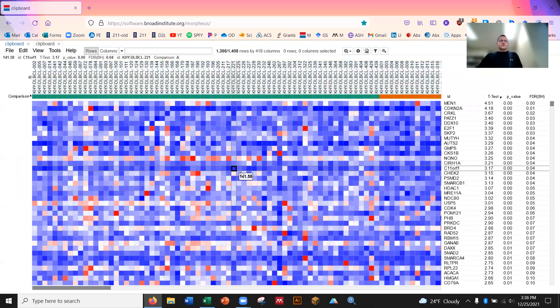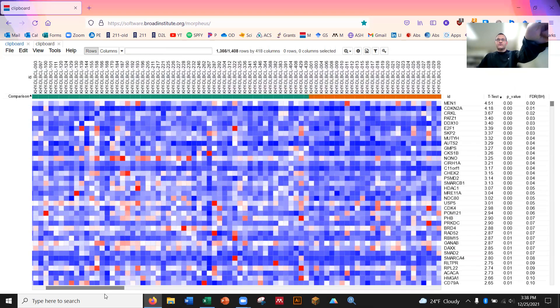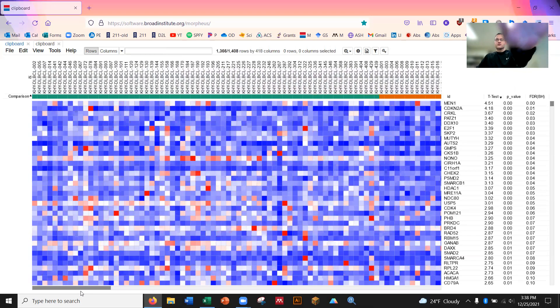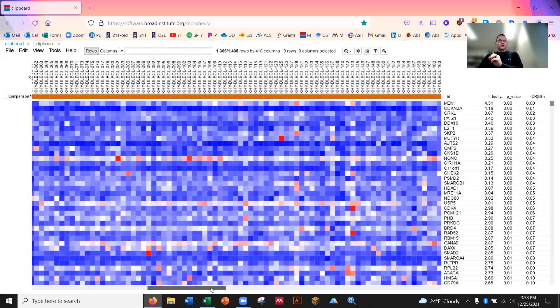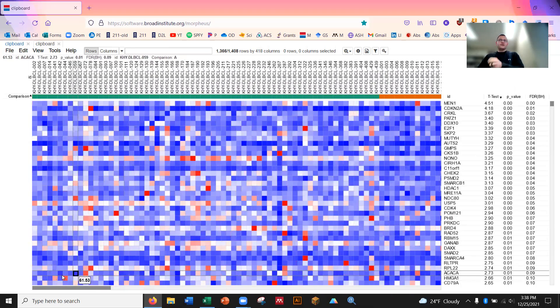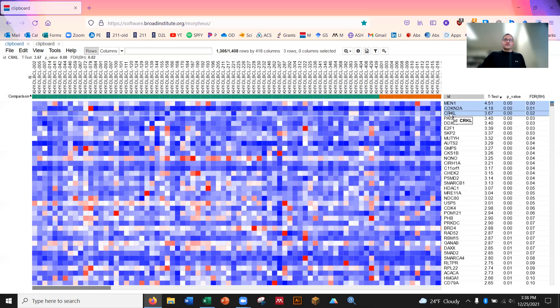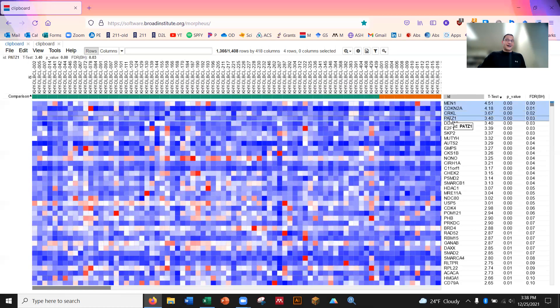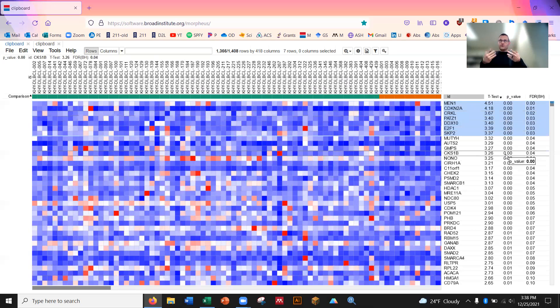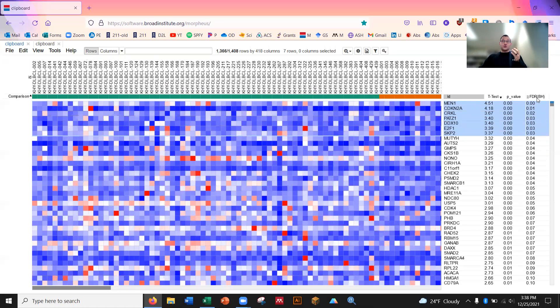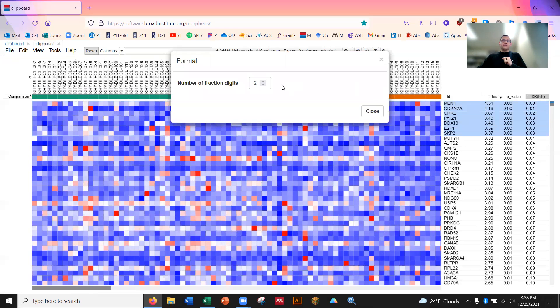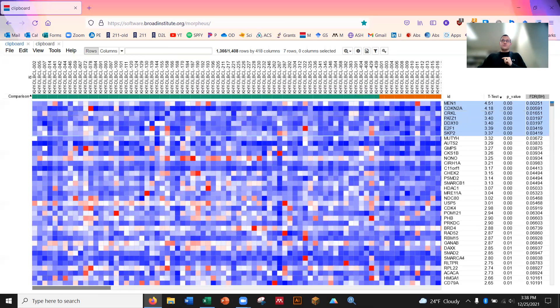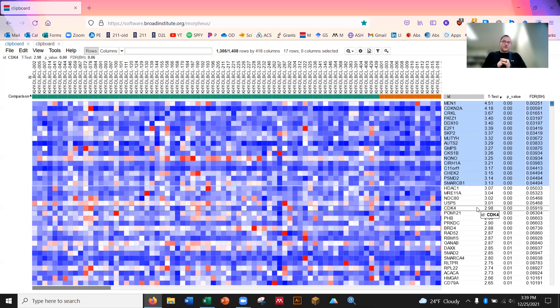Okay. So on the top right here, you can see we have a group in green. Those were our P53 mutants. See how there's like a big red collection right here and then quite a bit more blue. It's hard to visualize every time, but these are all the wild types in this case. So we have over here all the genes that are significantly high in P53 mutants. Now P values, you may remember, that's a significance value. 0.05 is significant, right? In a single test, yes. But we just tested 1400 tests. We have to correct for that.